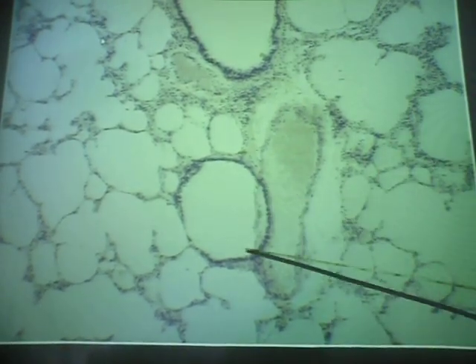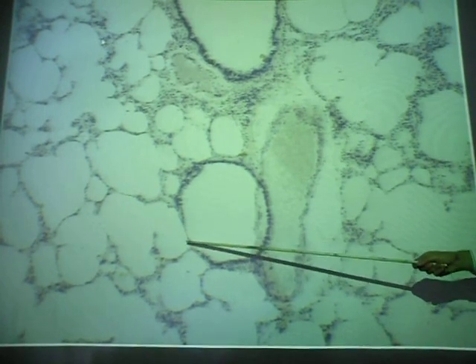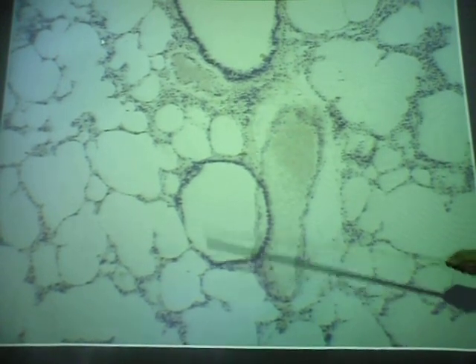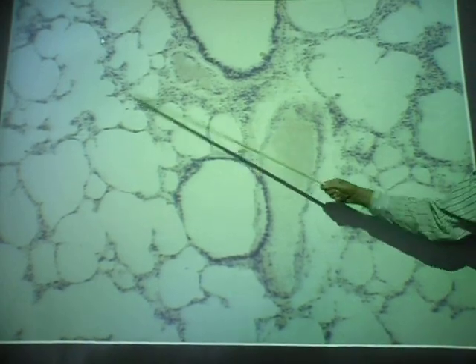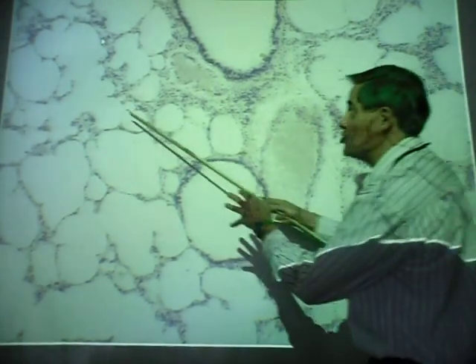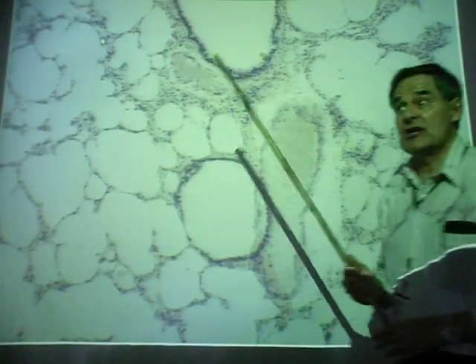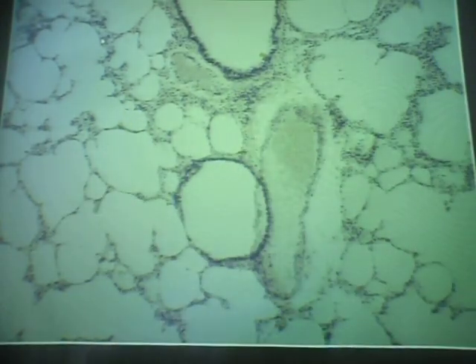So you can see the wall here looks like it's disrupted again. You're in simple squamous epithelium. That's an alveolus, which means it's a respiratory bronchiole. And these are all alveoli here. That's mostly what you see. When you see like a little channel, it is full of alveoli all around the wall, that'd be an alveolar duct. Let me show you another slide here.